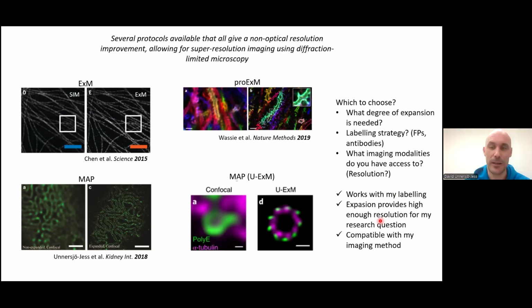I will get back to this later. So that's very, very hard to be close to the cover slip. And then it of course helps to use a water objective, even though the NA is a little lower. I mean, it's usually the only way to be able to succeed. And you also typically have a little bit more working distance with those objectives than with an oil objective.